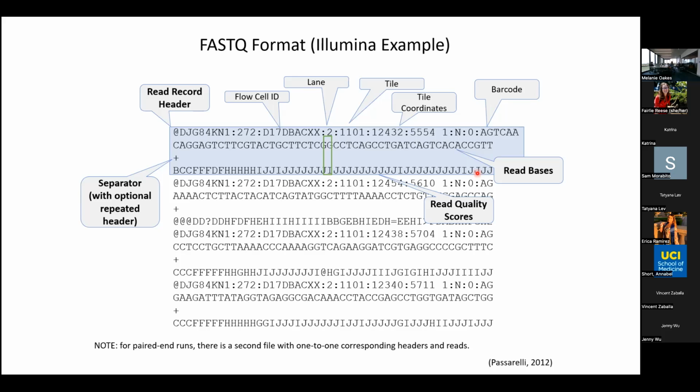Well, they've changed their chemistry. At one point, when they changed it from version 1 to version 1.5, we needed the reverse complement of that I5 barcode. So now people need to keep track. Honestly, if you drop off libraries or fill out your iLab form, you're not going to know which version of chemistry you're doing. So we just ask now, most of the time, that you provide us both sequences for your I5, and then we'll figure out which one it's supposed to be for you. I appreciate y'all listening to that little part because it will help.